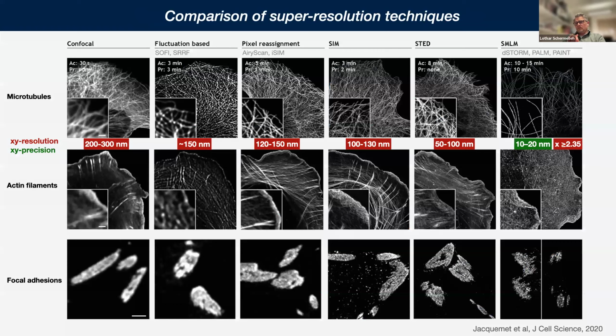Now, super resolution microscopy has been the center of attention for many years, and you have access to many instruments and techniques. Typically, most people still work with confocal microscopy, and this is a nice comparison from a not so recent review, looking at the same biological structures, microtubules, actin, focal adhesions, with different techniques.